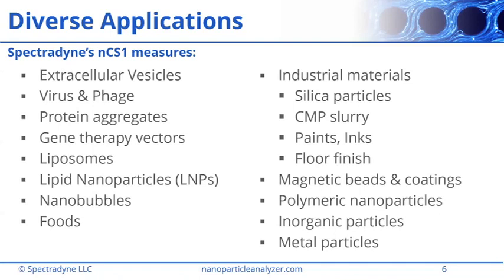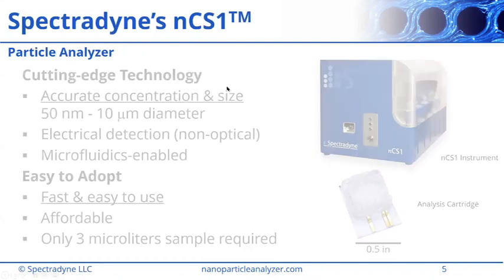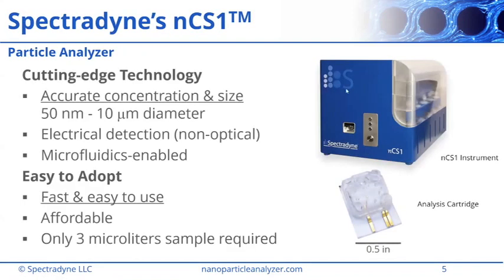Maybe we take one more because we are past the 30-minute mark at this point, and then for any other questions, you can certainly email us. Oh, hi. I missed the first couple of slides, I'm sorry if this is a repetitive question, but are there any limitations in terms of charged particles, just given how you're using electrostatic changes to measure the different sizes?